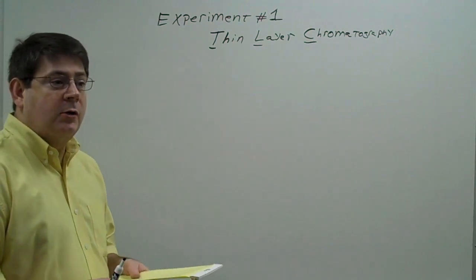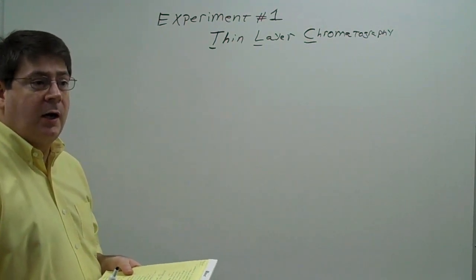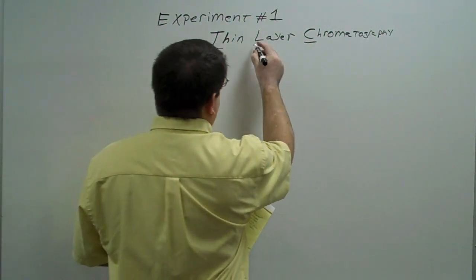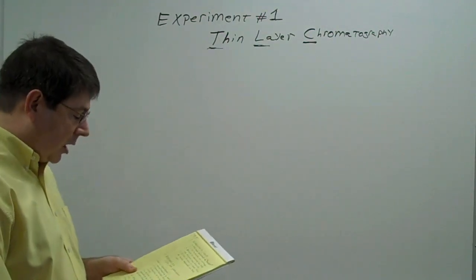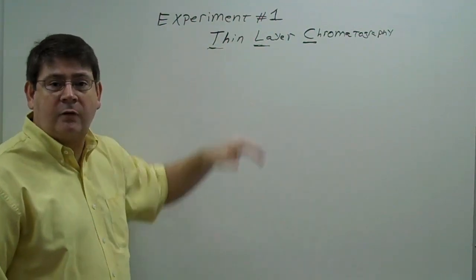Okay, well, welcome back to our video series. Today we're going to be talking about Experiment 1, which is thin layer chromatography, also known as TLC. So anytime you hear an organic chemist talk about TLC, you need to know that they're talking about thin layer chromatography. The first thing that you might be asking is, what is chromatography?